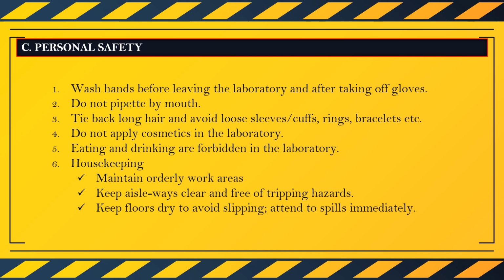And most importantly, everyone must know this, class. Number five, eating and drinking are forbidden inside the laboratory. And number six, for your personal safety, we should perform good housekeeping behavior. So housekeeping, by maintaining orderly work areas, keeping aisleways clear and free of tripping hazards, and keeping floors dry to avoid slipping, and attend to spills immediately.